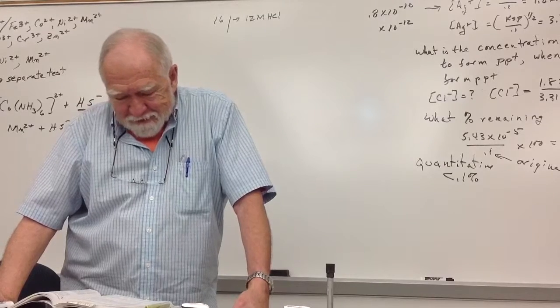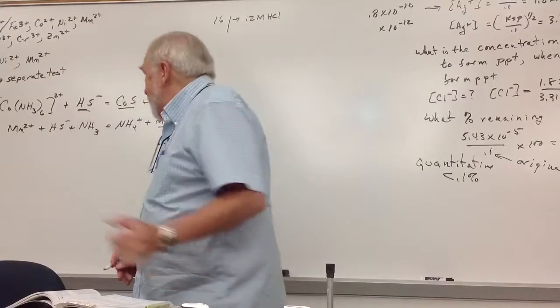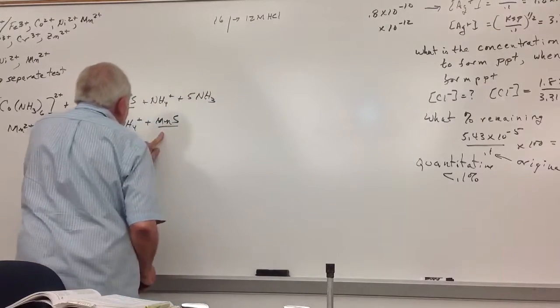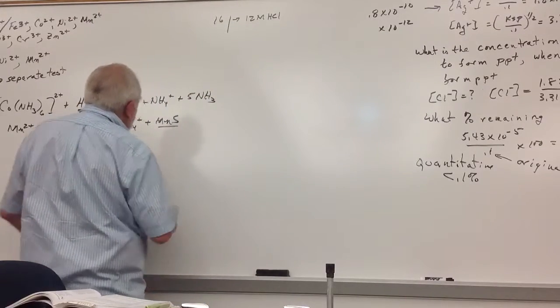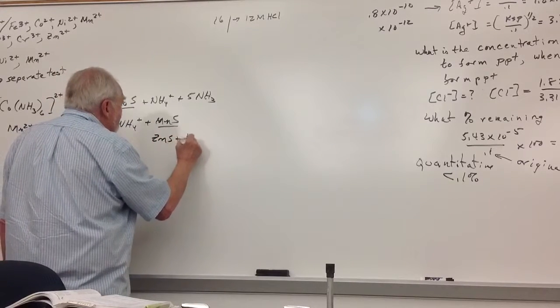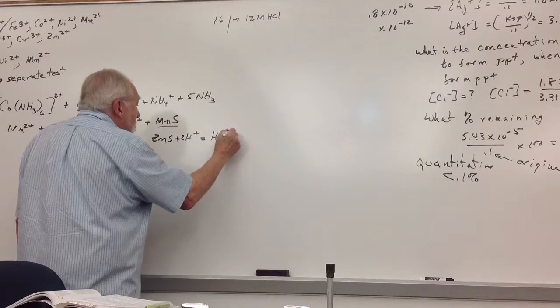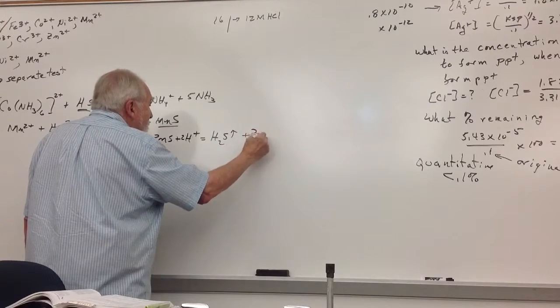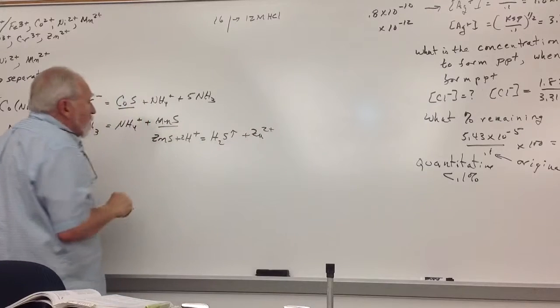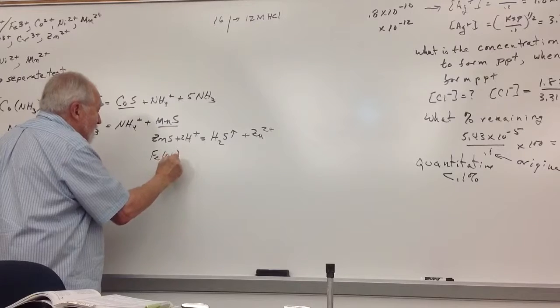So just put a big question mark over the 30 seconds. If you have something like manganese sulfide or zinc sulfide is even better. But this will also dissolve in a similar fashion. You have something like this, very simple equation.